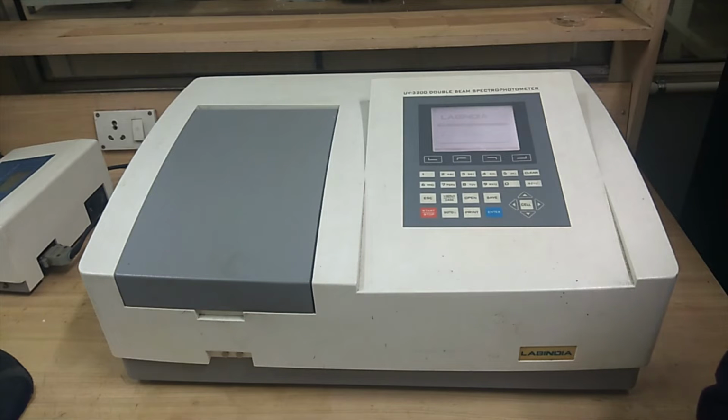So the dye strongly binds to the positively charged groups of protein, and also to hydrophobic regions in the protein. As a result, there is a formation of blue color in the sample, which has a maximum wavelength of around 595.